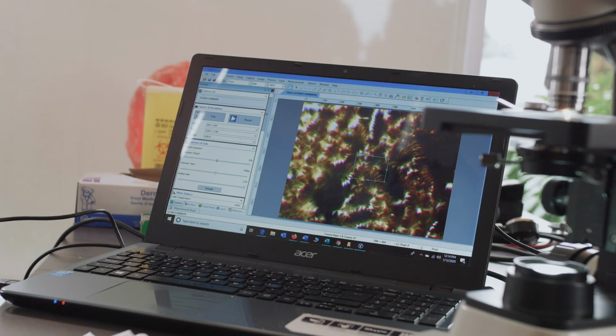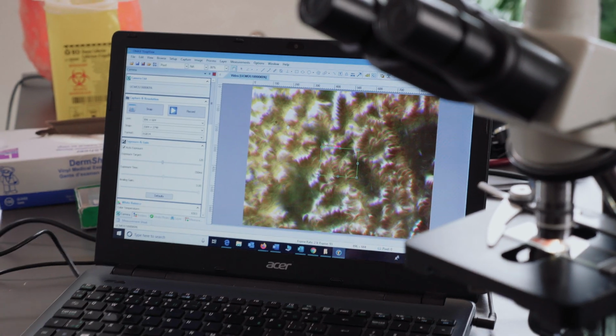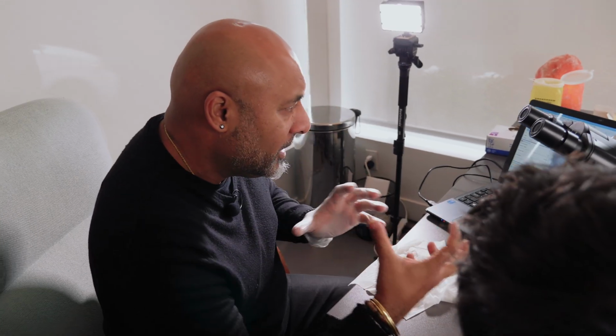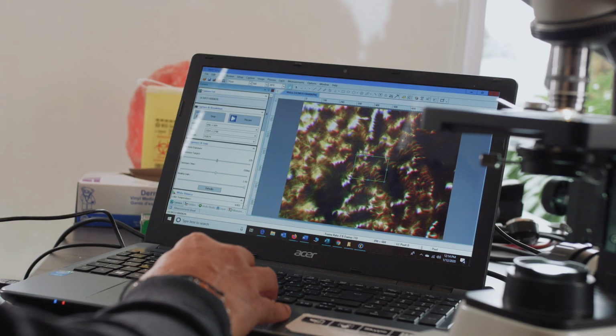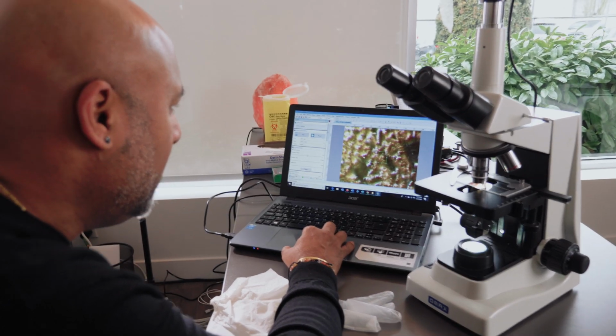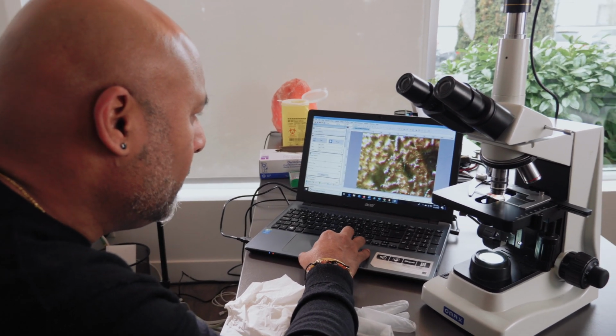So we're seeing a formation that's known as a rouleau formation. They are sort of like stacked on top of each other. It's almost like a caterpillar sort of. And we're starting to see some individual cells down here, but we're seeing these captured on top of here.